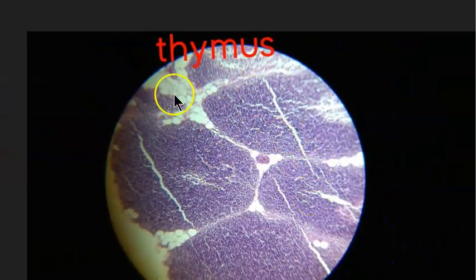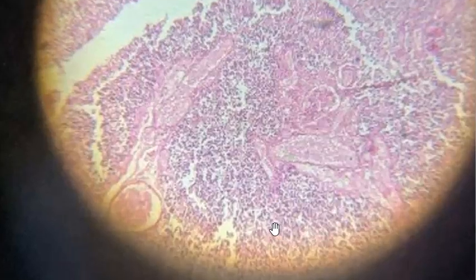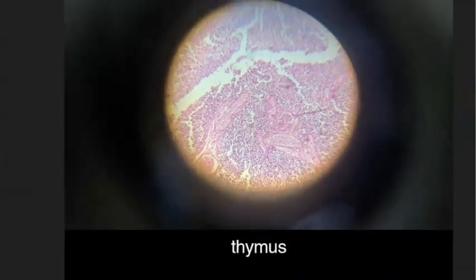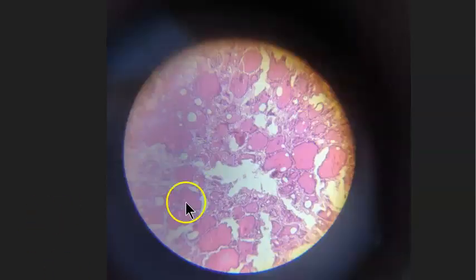Lymphoid, yes, thymus. So it is having those special Hassall's corpuscles, right? But same thymus, it doesn't look that purple here. But what and all, it will have capsule, cortex, medulla with those Hassall's corpuscles, right? Again, one more thymus here. Very easy, you can guess this one.